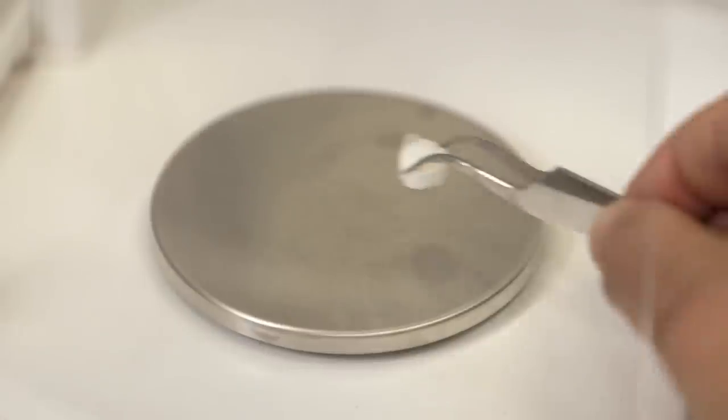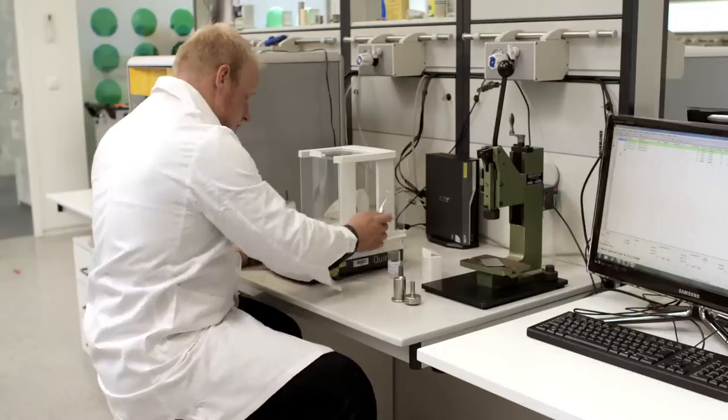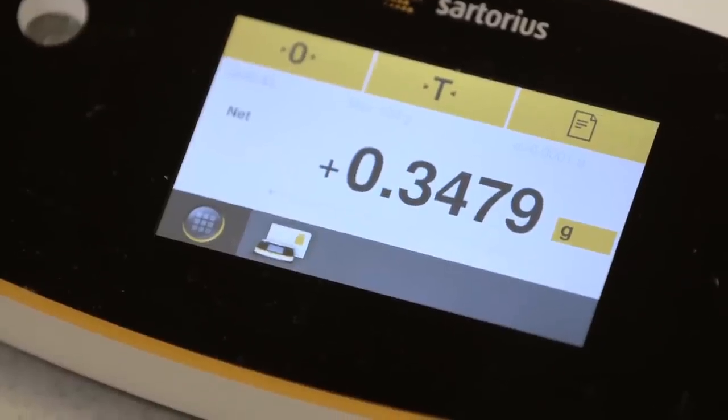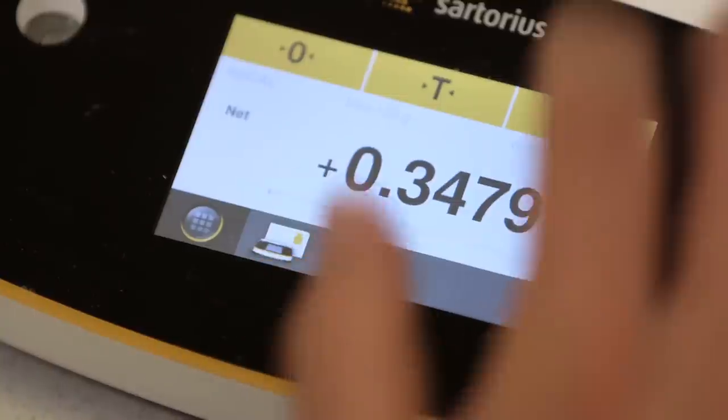Finally, the weight of the ready-to-use pellet is determined and automatically transferred to the software by balance connection. In this way, mistakes from manual sample weight transfer can be excluded.